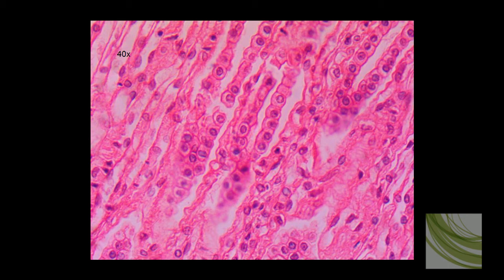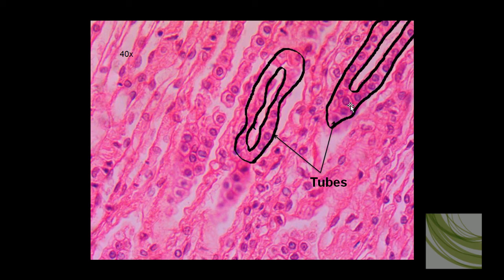Here is the slide using the 40X objective, and we can see tubules, and each one of these little cells is a simple cuboidal — one layer of a cuboidal cell. We've got several tubules here, and I've outlined two of them for you. That's the best way to find or identify this tissue: look for these tubules. You can find the lumen inside, and you'll see one layer of these square-like cells lining each of these tubules.